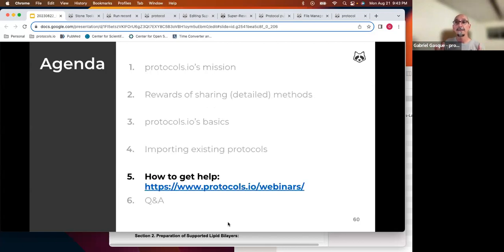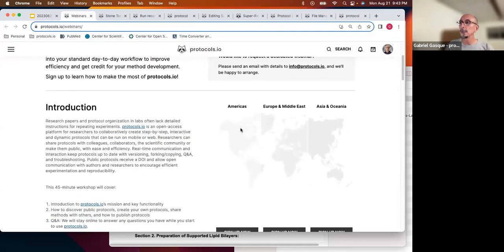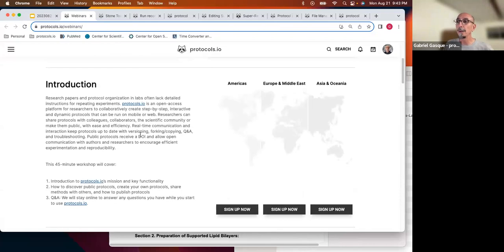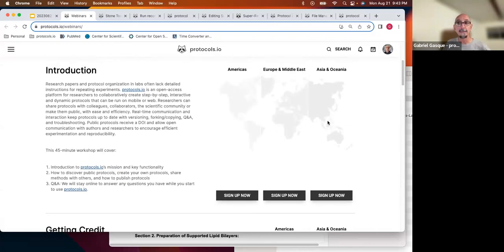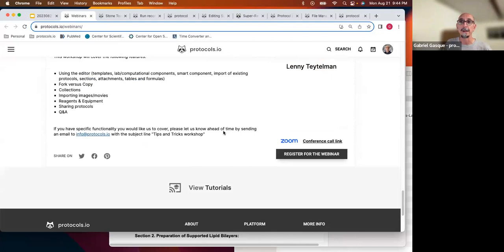Now, before we finish, I want to show you, because I was unable to share with you all the information and show you all the tools that we have, that you can get further training. And one way of doing that is go to protocols.io/webinars, which will take you to the list of webinars that we offer regularly. There are 3 topics that are organized by time zone. So you can find the topic that you want to attend, find your time zone, and register. And if you scroll further down, you will see the list of upcoming webinars.